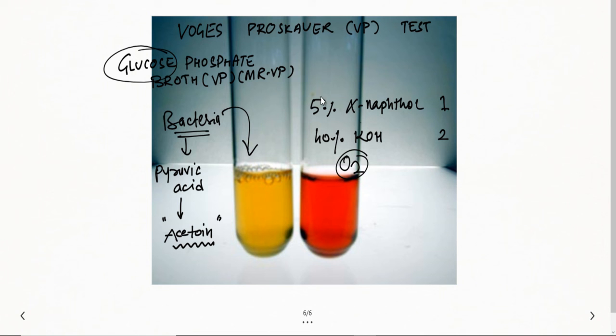If red color is seen, the VP test is positive. If you do not see any red color after adding the reagents, the Voges-Proskauer test is negative.